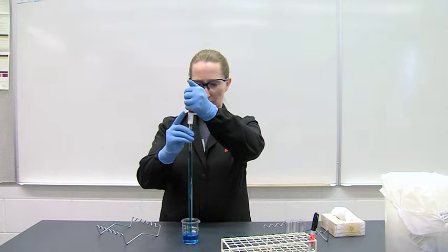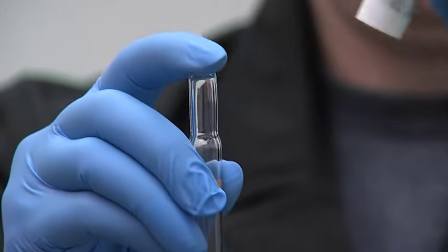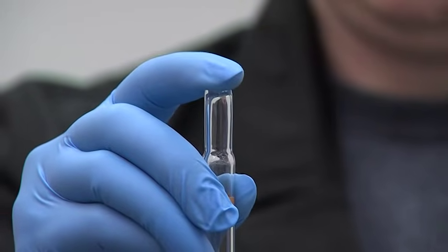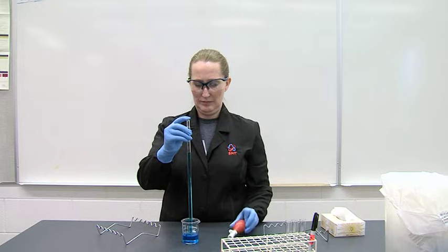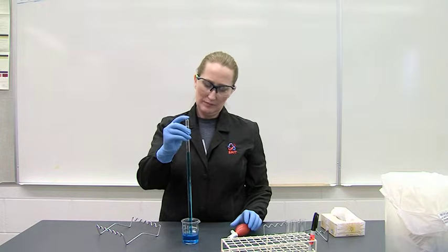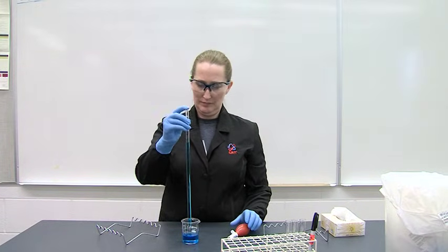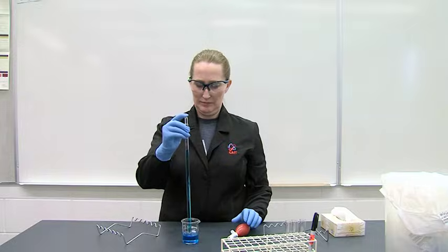Remove the bulb and cover the top of the pipette with the index finger. Check for bubbles. If there are no bubbles, proceed. If there are bubbles, drain the liquid back into the beaker and try again.